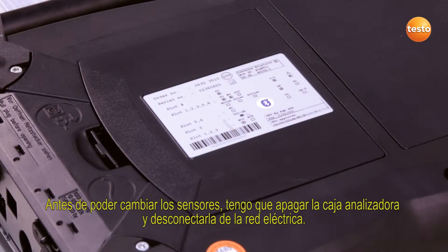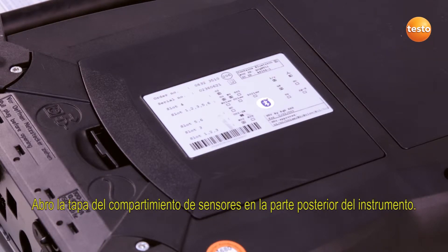Before I can replace the sensors, I have to switch off the analyzer box and disconnect it from the power grid. I open the sensor compartment cover on the rear of the instrument.